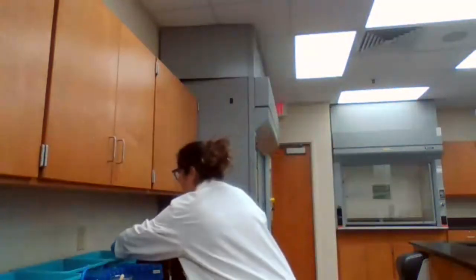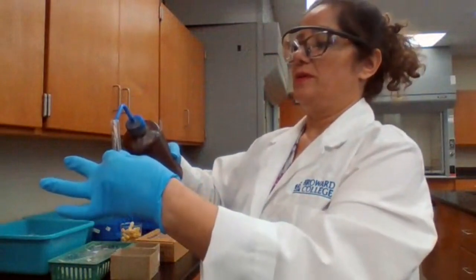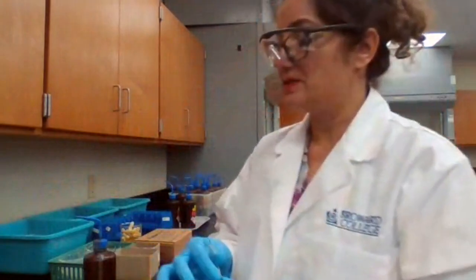Step 1 of the experiment, we are going to prepare a hot water bath. Yes, we did prepare the hot water bath. We are going to get 10 drops of the known solution of group 1 and 2. What does it mean is known? That means that all 4 ions are in there. So we get 10 drops into a test tube. Okay. We have 10 drops of the solution in a test tube.